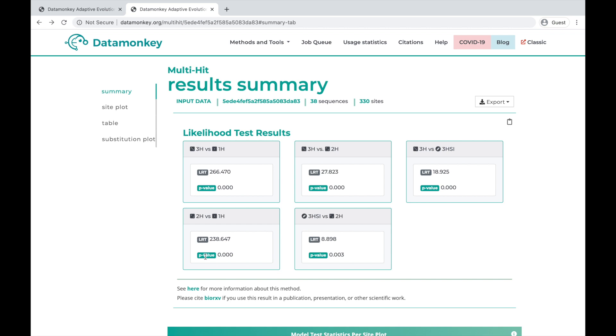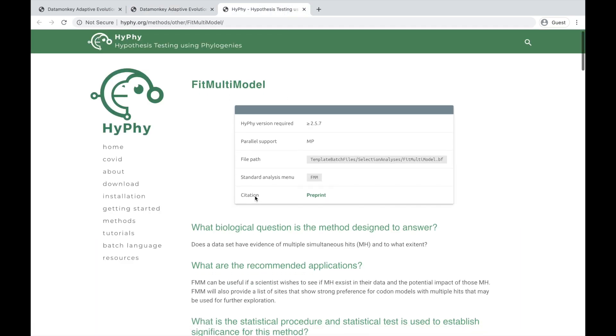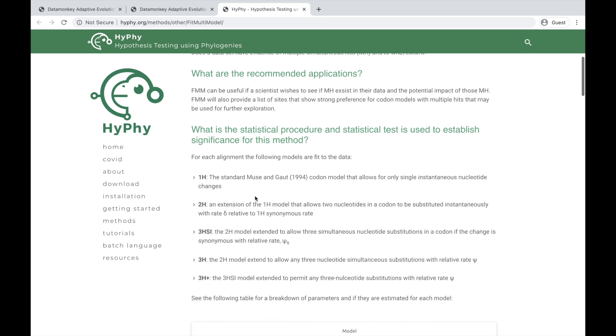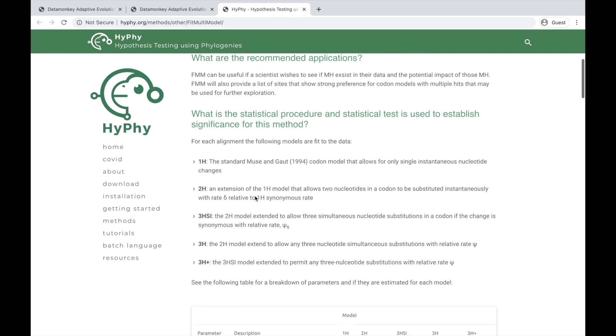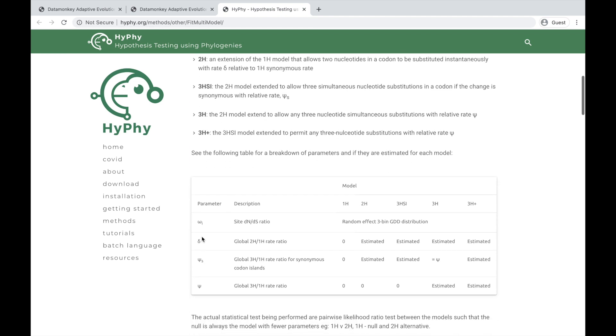If you want to know more about how each model is parameterized, you can click here, which will take you to a page with more information about the method and the definitions of each model type and the parameters that are estimated in each model.